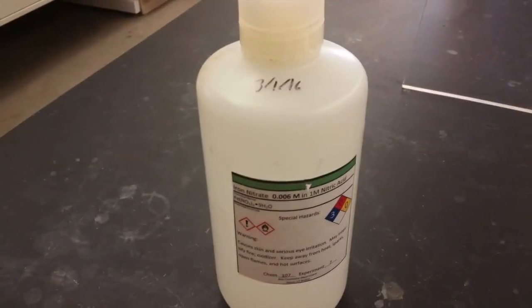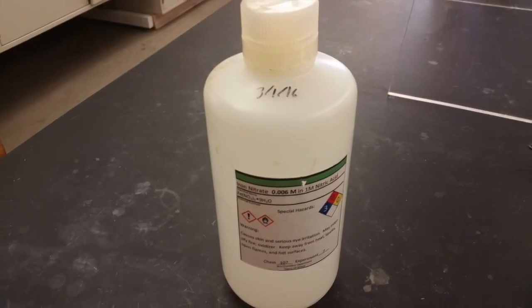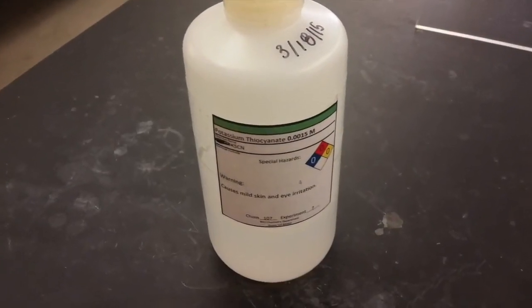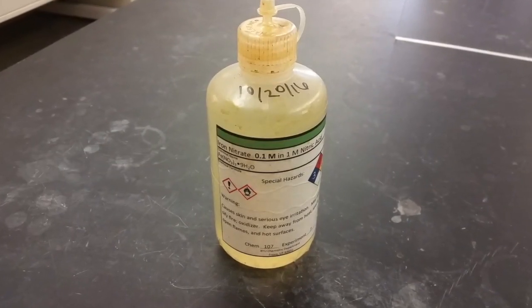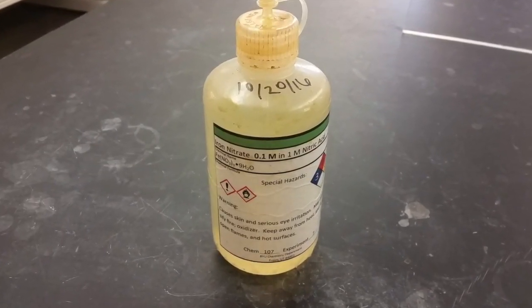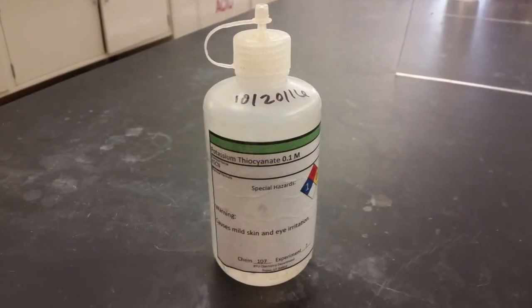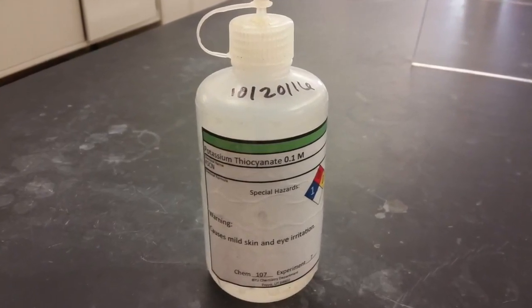For example, we have some solutions that are dilute, something like 0.006 molar or 0.0015 molar, and we have other solutions that are concentrated, something like 0.1 molar or 1 molar. Be careful that you're reading both the chemical name and the concentration on the bottles when you're gathering your reagents. That's all for today, good luck!